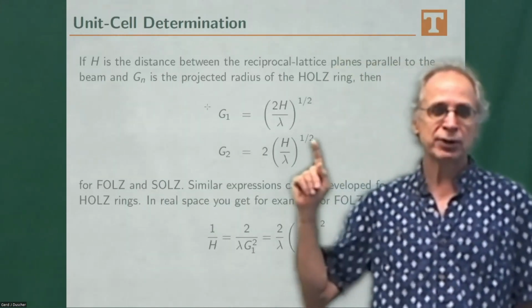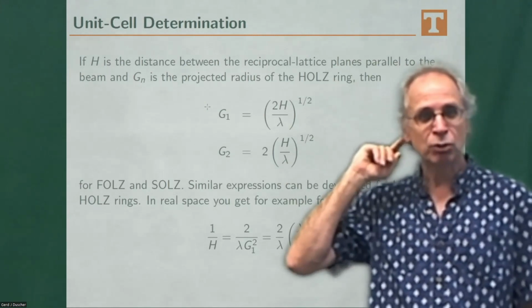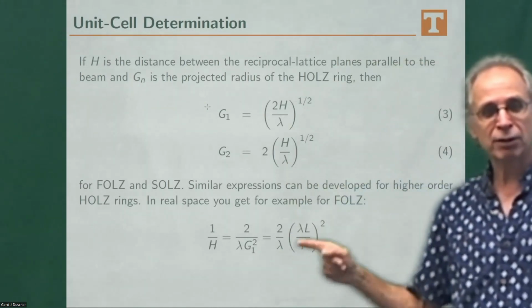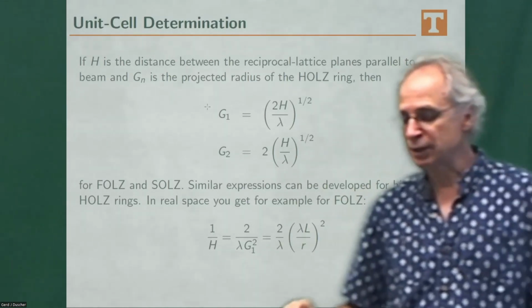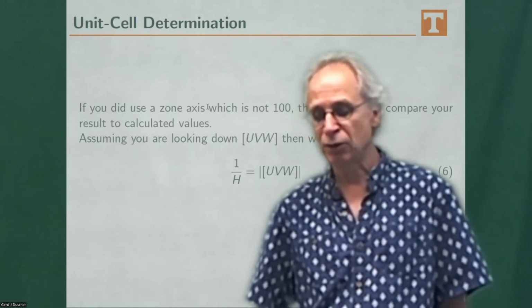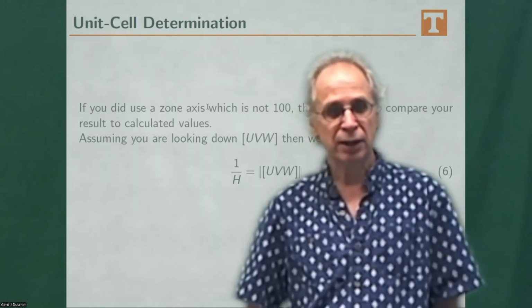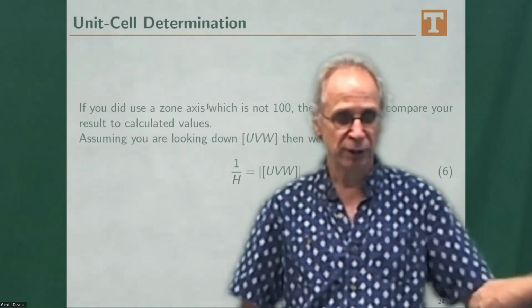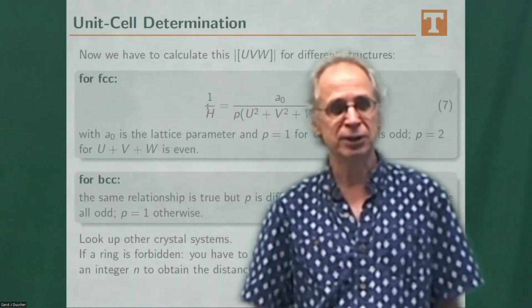Then, because it is related directly through trigonometry, we can correlate that with the wavelengths and the radius of this higher order Laue zone, and you get actually these rings. Can of course also simulate them. It's automatic, right? So we did that already.